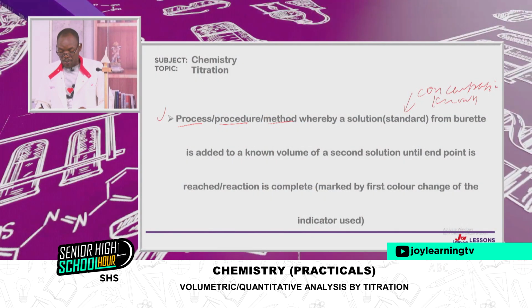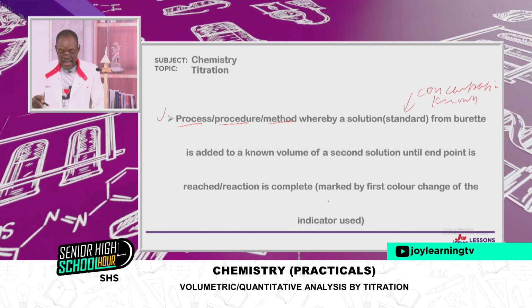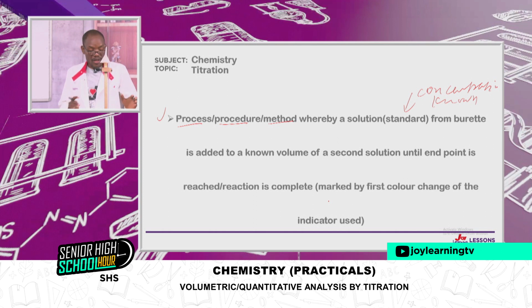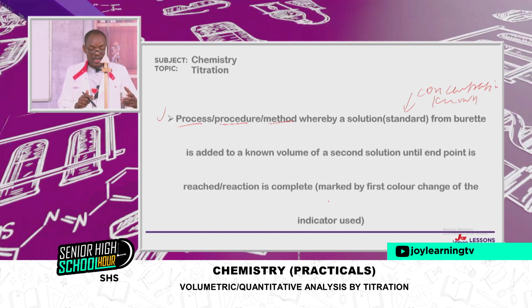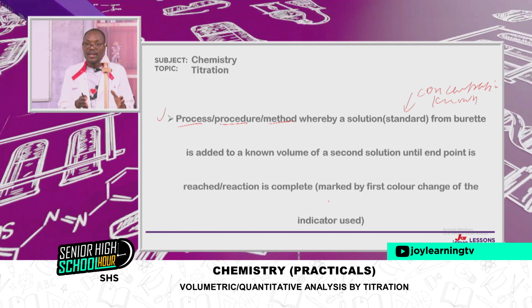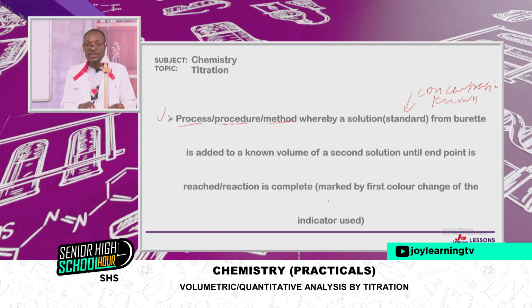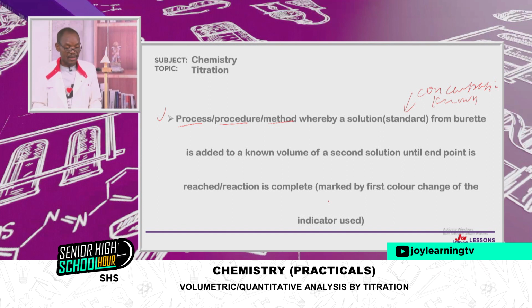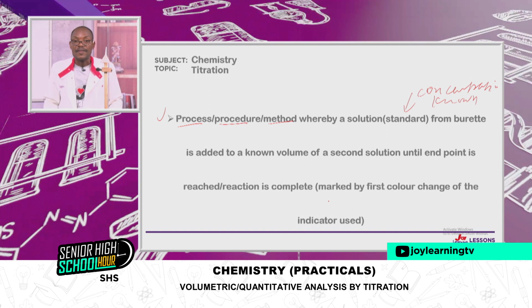So the reaction is complete. This is marked by the first color change of the indicator used. So the moment you are running the titration and you see a first color change, that tells you that the reaction is complete. So you stop. Take your readings on the burette and then repeat the process until you get the values.